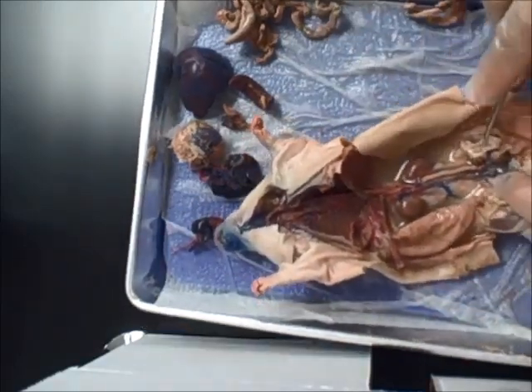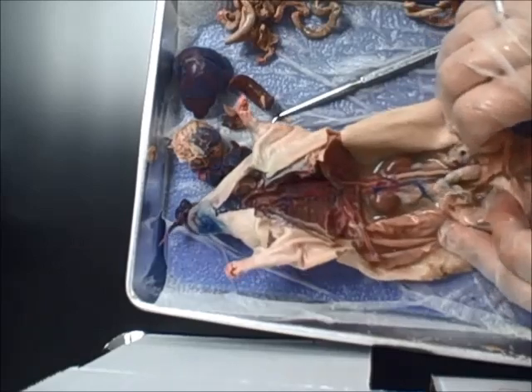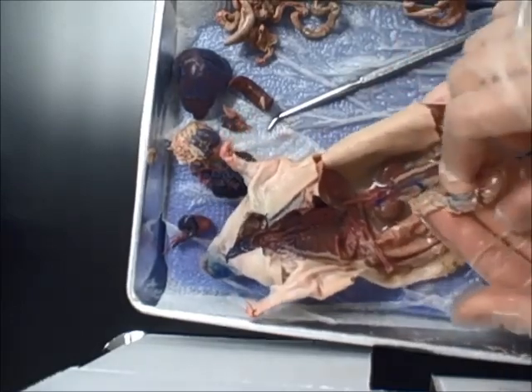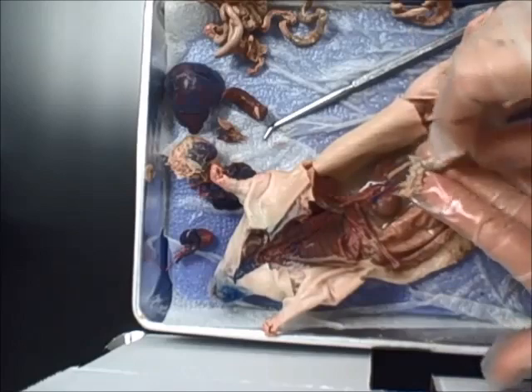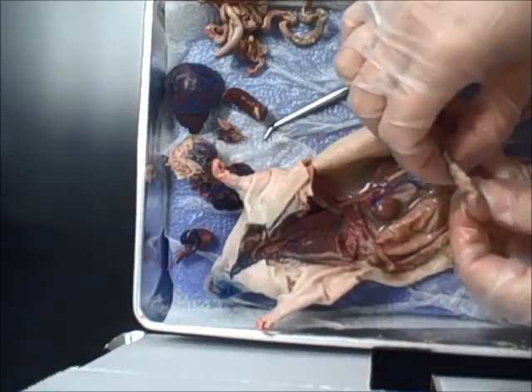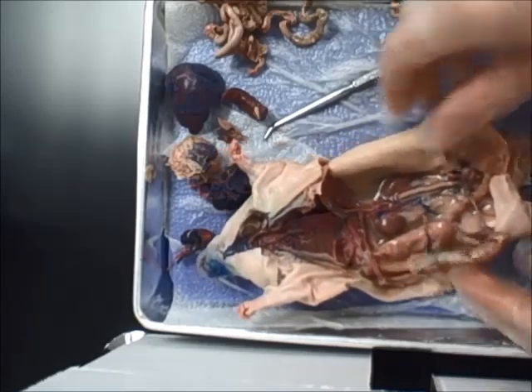The reproductive organs are also here. You see seminal vesicles that add to the semen. And then down in the scrotal sacs, you have the testes. So I'm going to push the testes out of the scrotal sac so you can see the testes. So here's one. So that's one testicle. And then the testicle has the epididymis, where the sperm mature, and then it connects to the vas deferens. And then the vas deferens ultimately connect with the urethra. Okay, so that's the male rat.